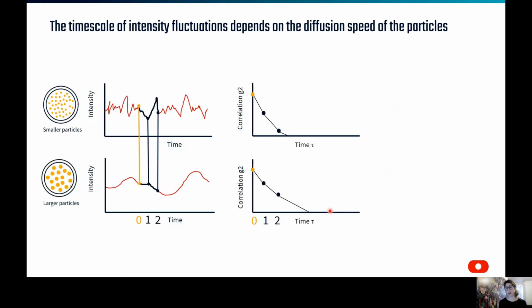So at the initial position, the signals are pretty similar, regardless of the particle size. The autocorrelation function or autocorrelation value is going to be quite large. So it's in our instrument roughly 1, which we see at the initial time point I(t) or time 0 in both of these plots here.